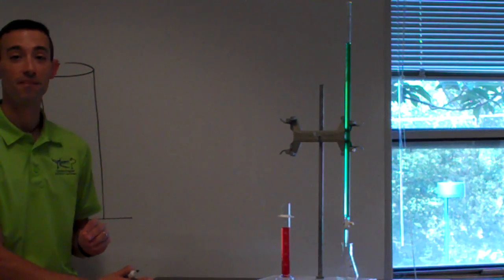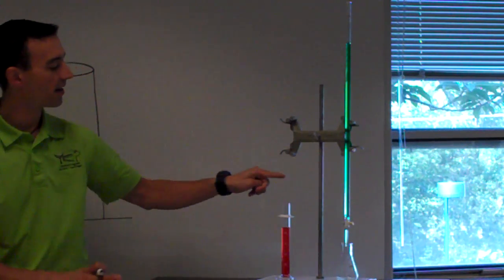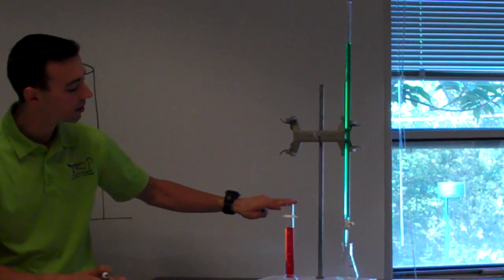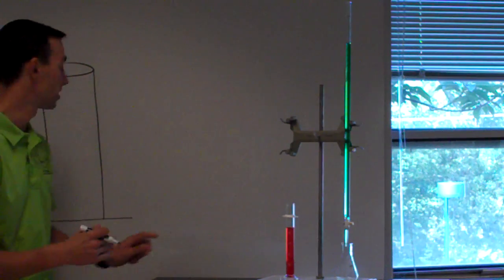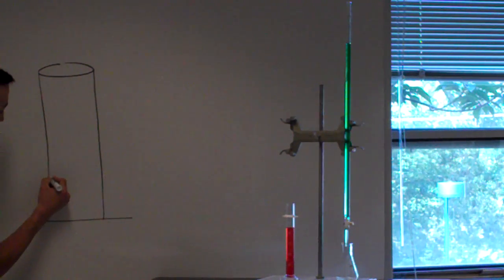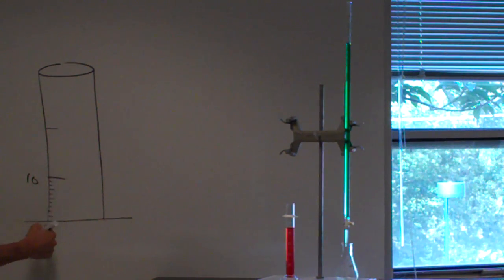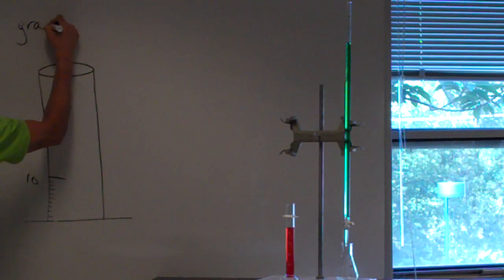Of the two pieces that I have here, the graduated cylinder is marked off in terms of whole milliliters. So the markings, there are large markings every 10, but it does show us the individual 1 units. Okay? So this is our graduated cylinder.